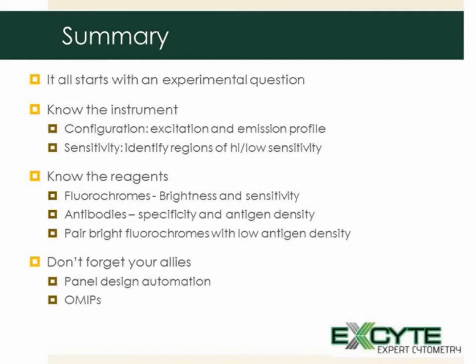You need to know the sensitivity of the machine, how sensitive each PMT is, and more importantly, where there are regions of high or low sensitivity so that you can design your panel around those, taking advantage of regions of high sensitivity and using regions of low sensitivity for things like viability dyes to eliminate dead cells, dump channels to eliminate cells that you're not interested in.